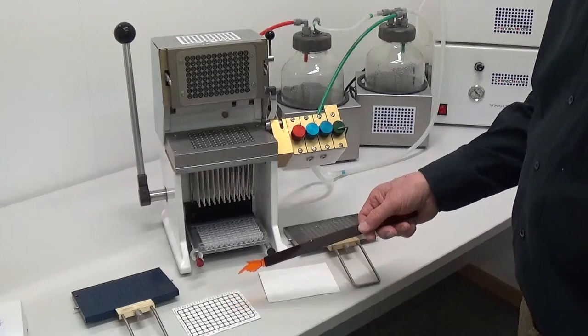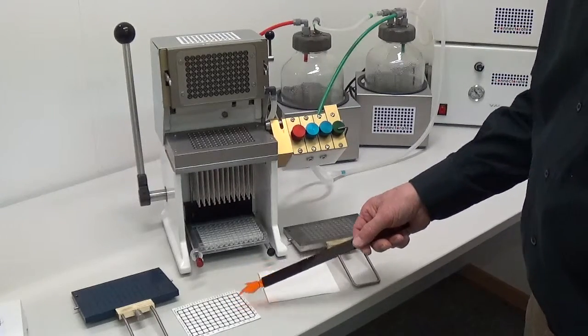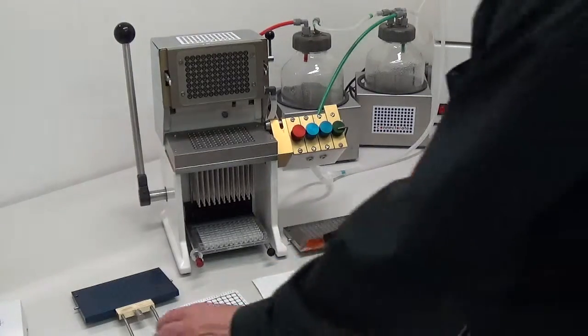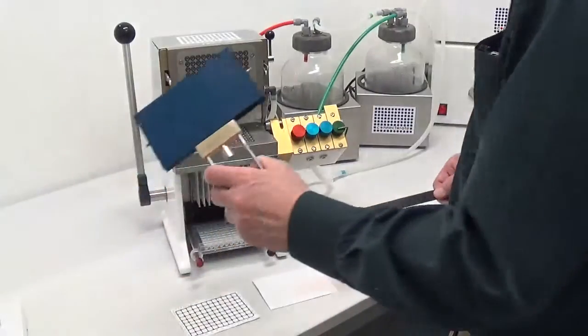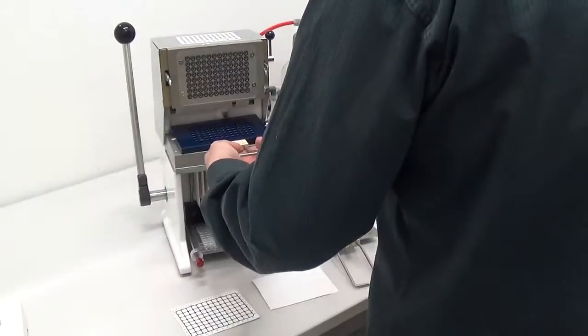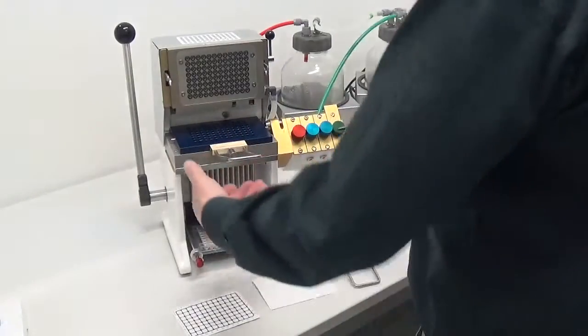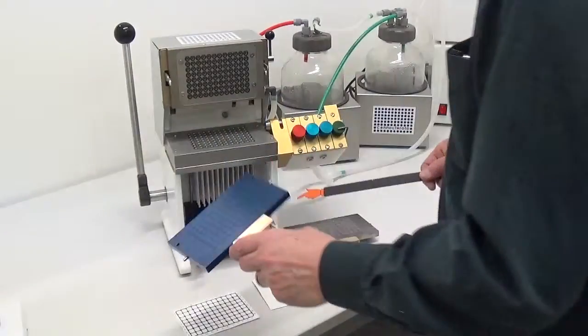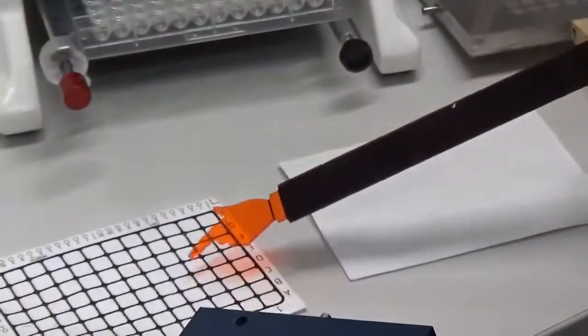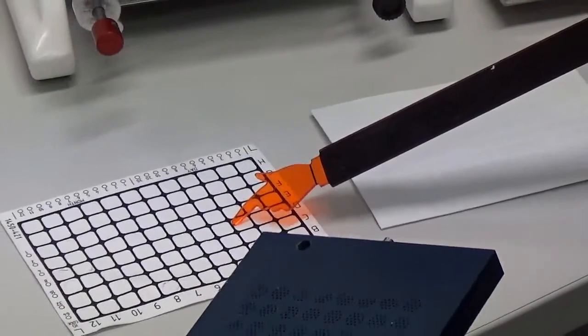If you decide to use filter mats for harvesting, you have first to place a filter holder plate on the pipetting head. This filter holder plate is blue for gridded filter mats.